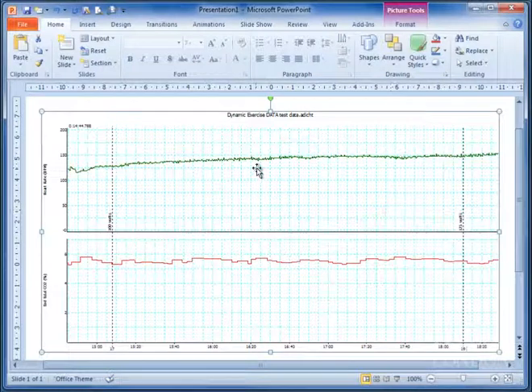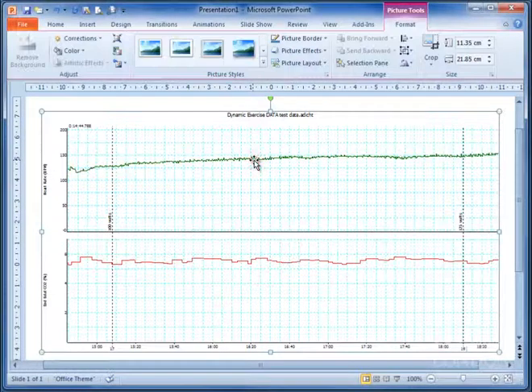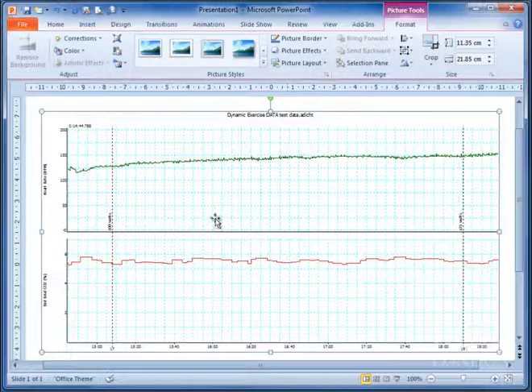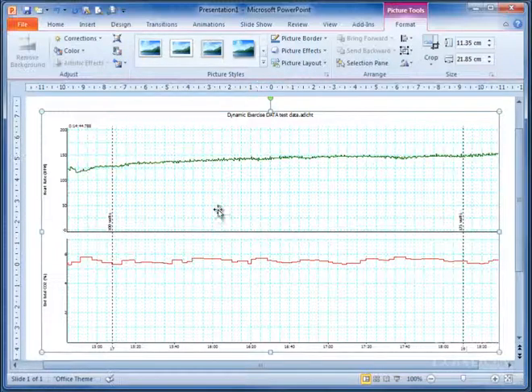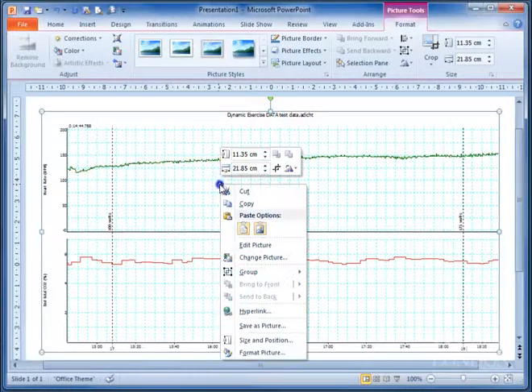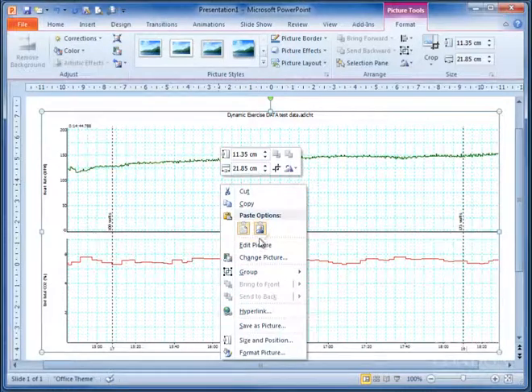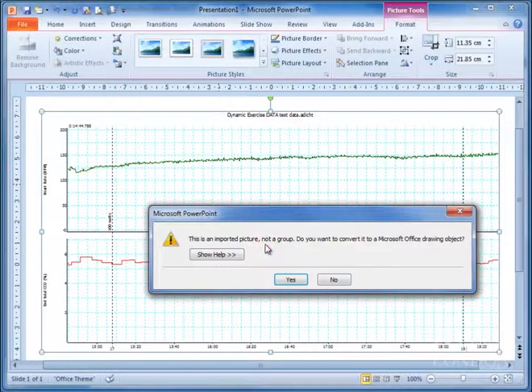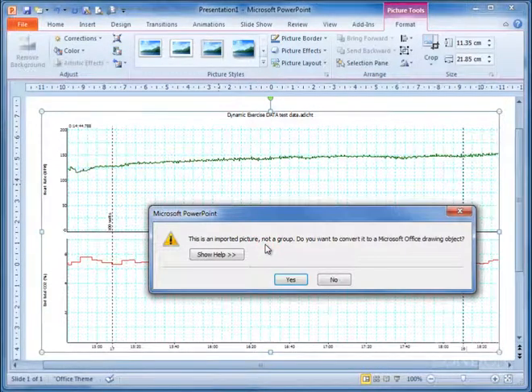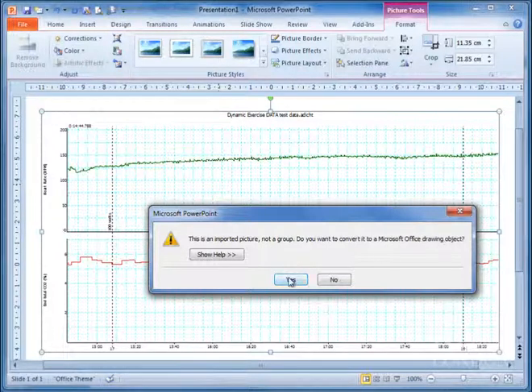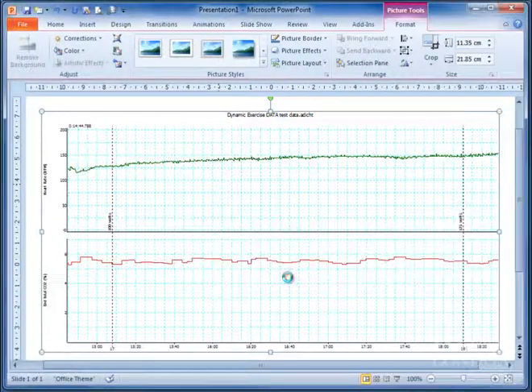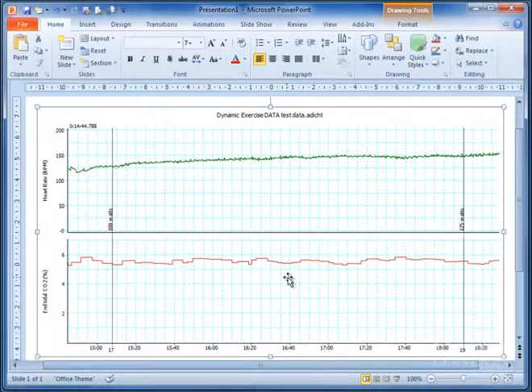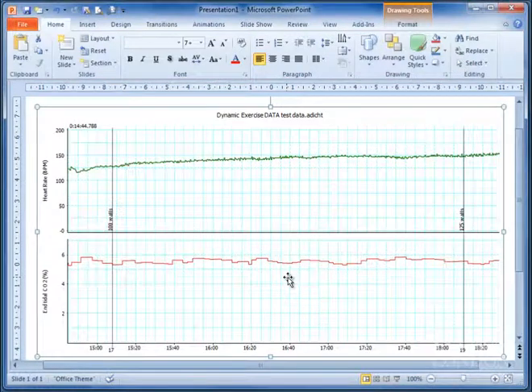Okay, I can't edit this. If I double click on it, it brings up the picture tool. So it's essentially still a picture, it's not anything I can edit at the moment. So to be able to edit this, I can right click and choose edit picture in PowerPoint. It'll ask me if I want to convert it to a drawing object, and I say yes. It takes a few seconds, and then you'll see that it transforms it.